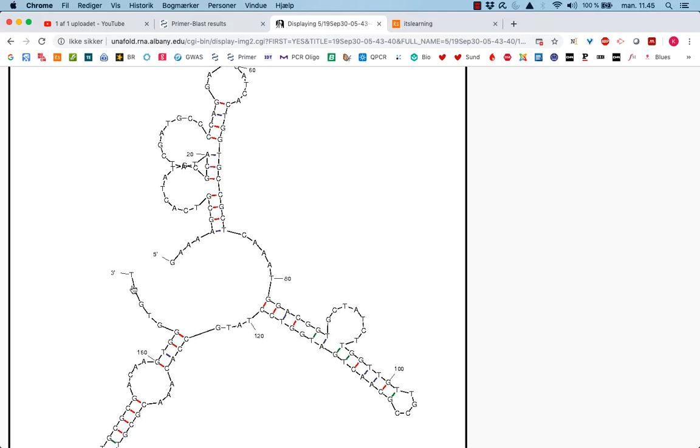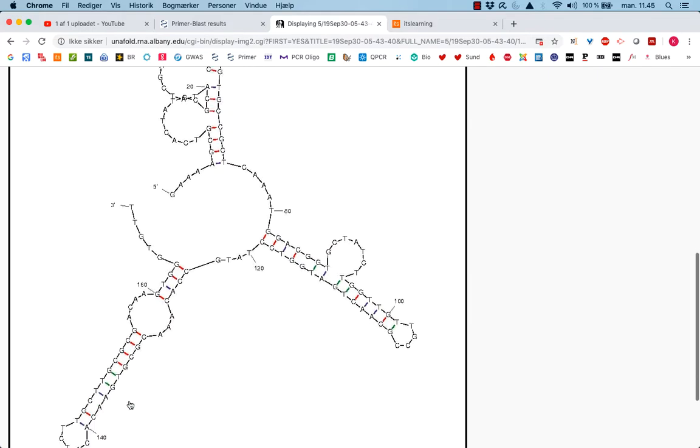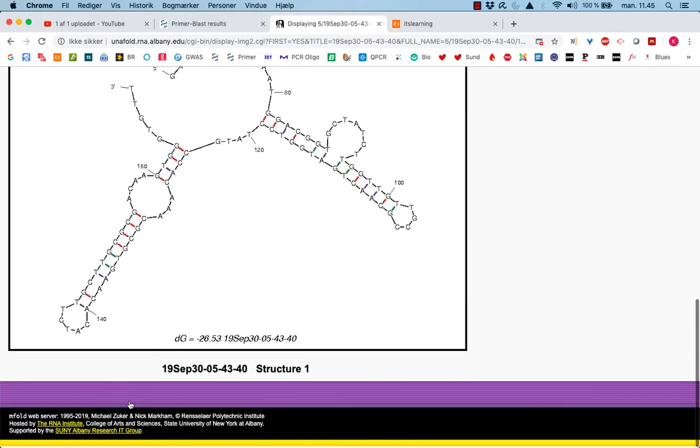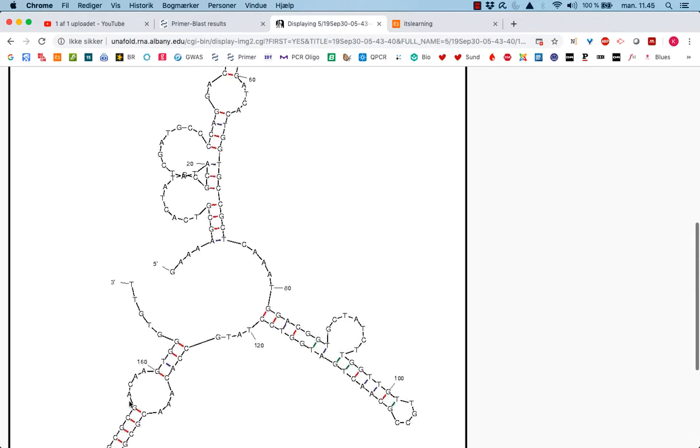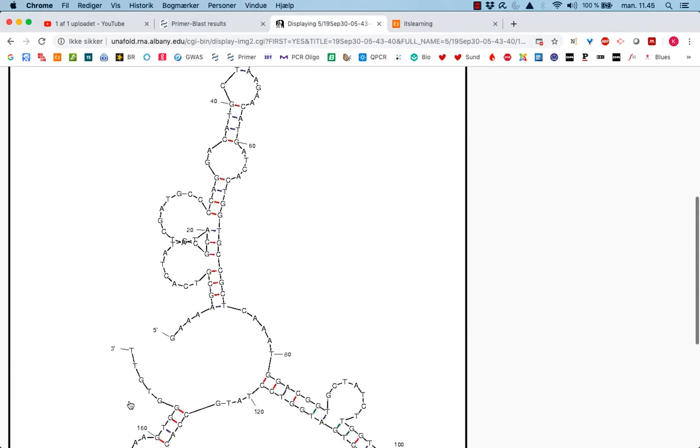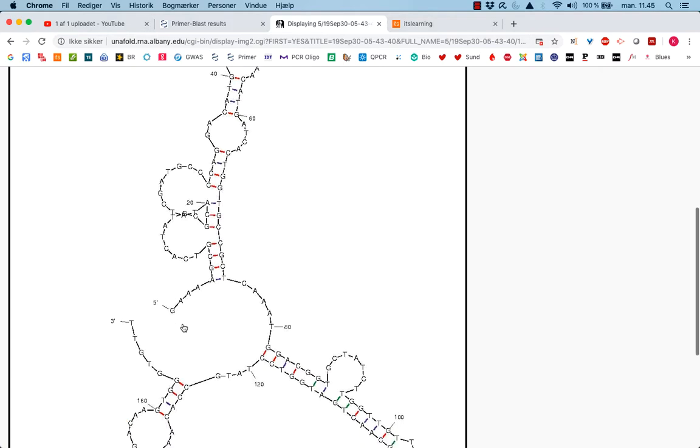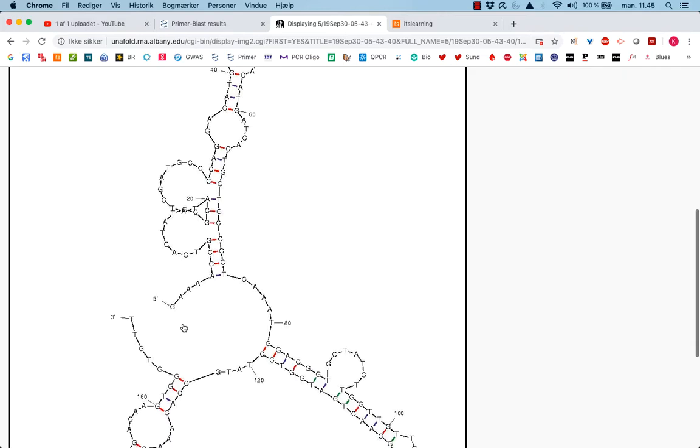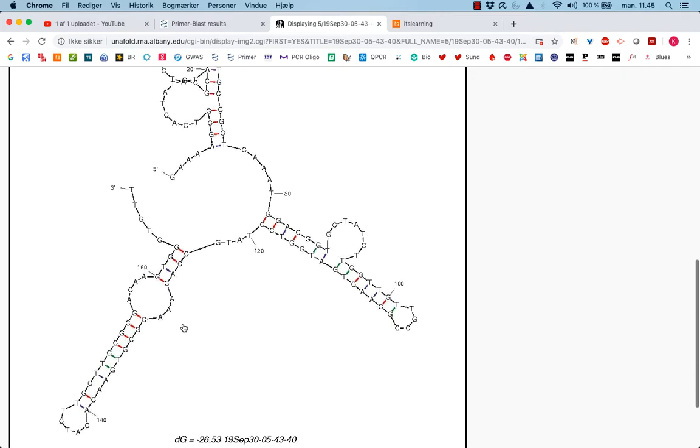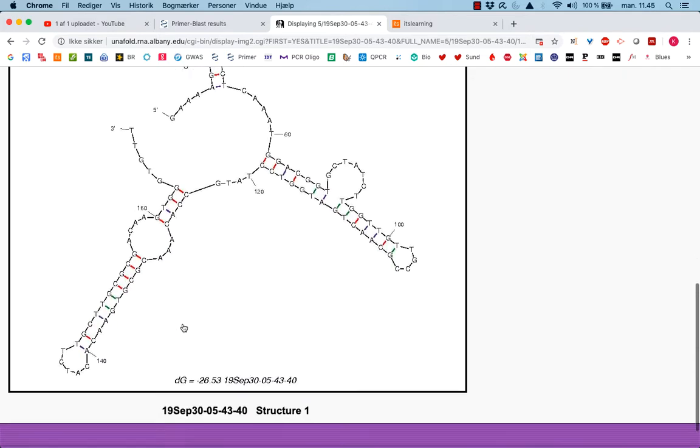And the other end, again, secondary structure starts at three, four, nucleus high number six. So the end is free, but there's quite a lot of secondary structure here. Based on my experience, the most important thing is that the end of the product is free so we can actually attach our primers.